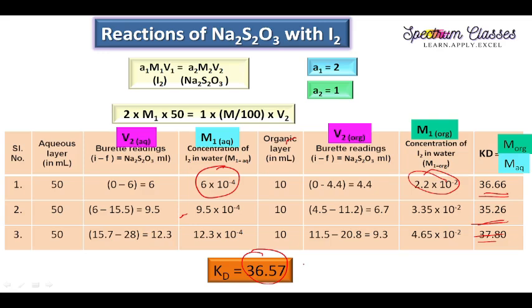In some of the texts I have seen some 72 something as the partition coefficient for the n-hexane and water system. But I repeated my experiment and I get the same results again. So I don't know where the problem is. You can check by yourself carefully, right?